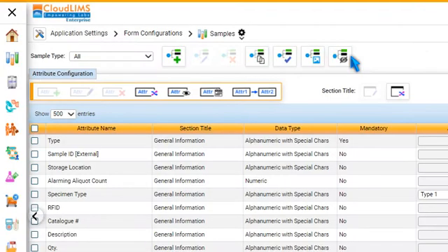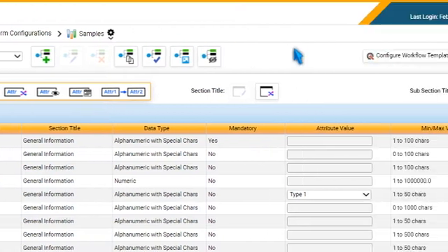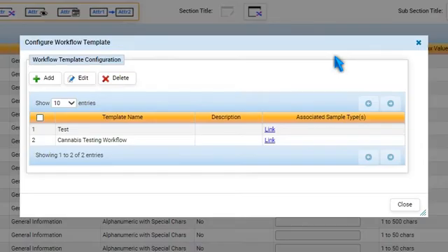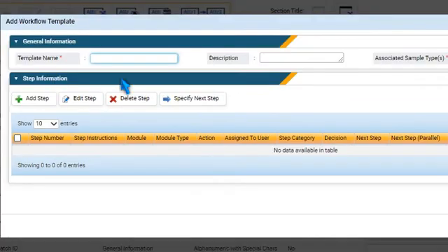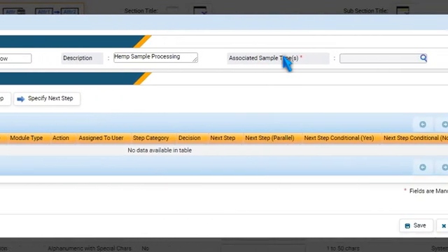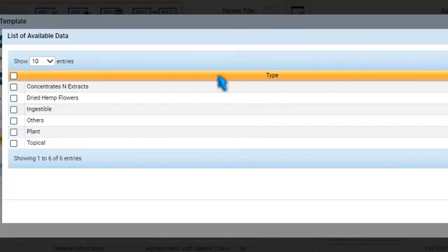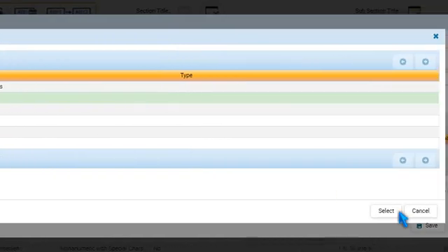Now, switch to the Samples configuration and press Configure Workflow Template. To add a new template, press Add. Specify a template name and description. To associate sample types with the template, press Browse. Tick one or multiple sample types and press Select.